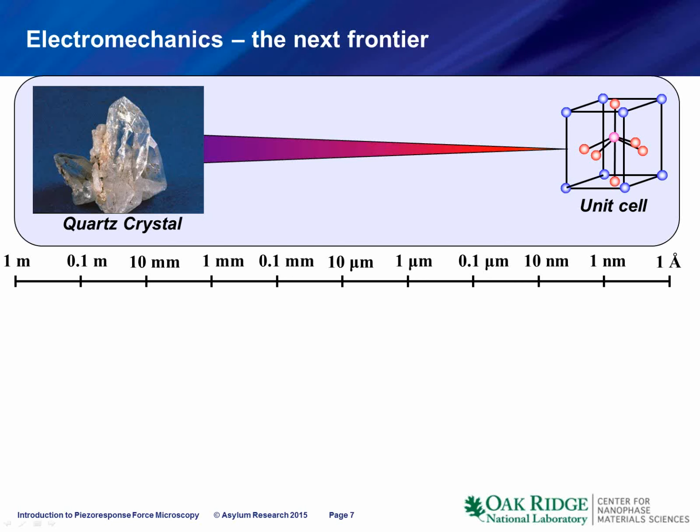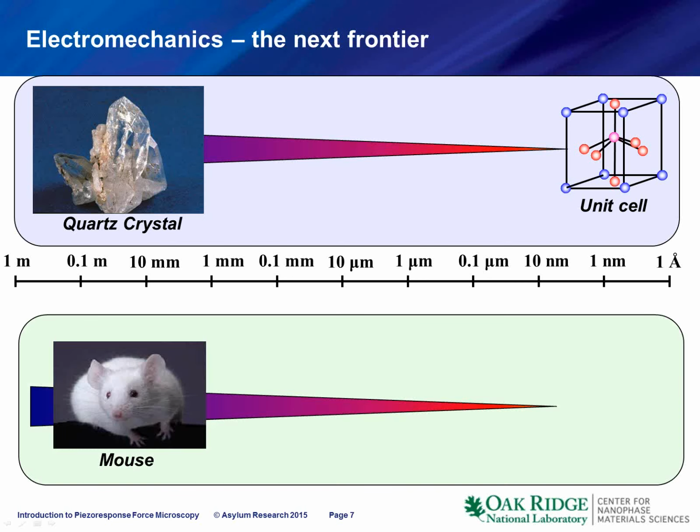Unfortunately, this approach doesn't work for more complicated systems, for example, aforementioned biological system. So, for example, I can purely theoretically apply 2 electrodes to the mouse and apply voltage across it, and most likely the response of the mouse would be extremely strong.